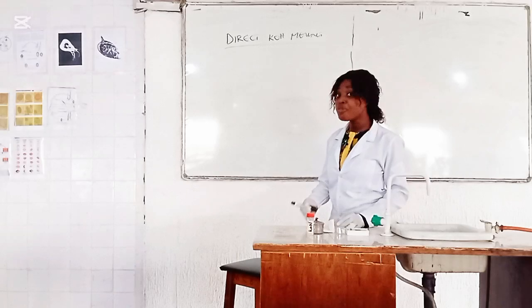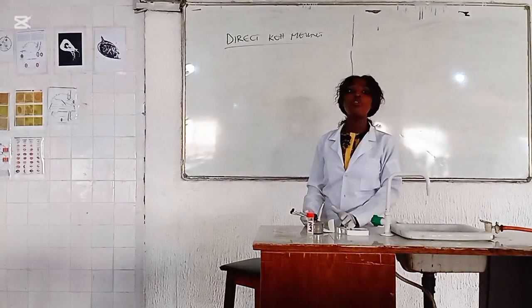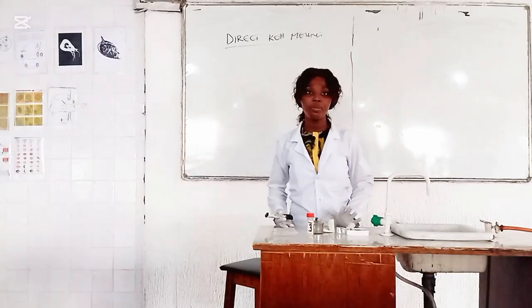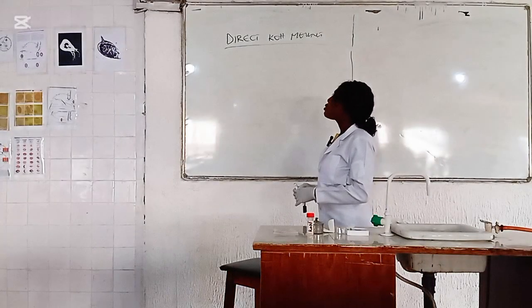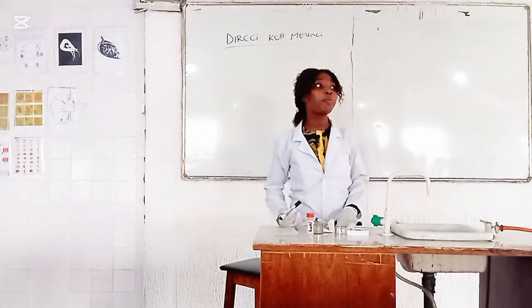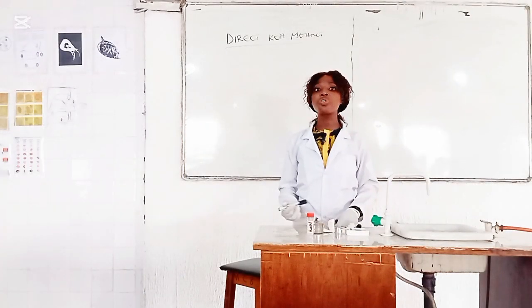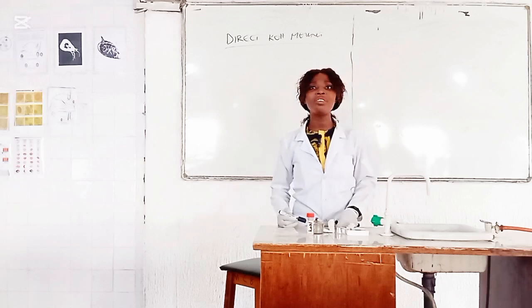Now, fungi are a group or a class of microorganisms that grow at room temperature. We have different kinds of samples that we can use KOH on. You can use a hair sample, skin scraping, nail scrapings, name it.